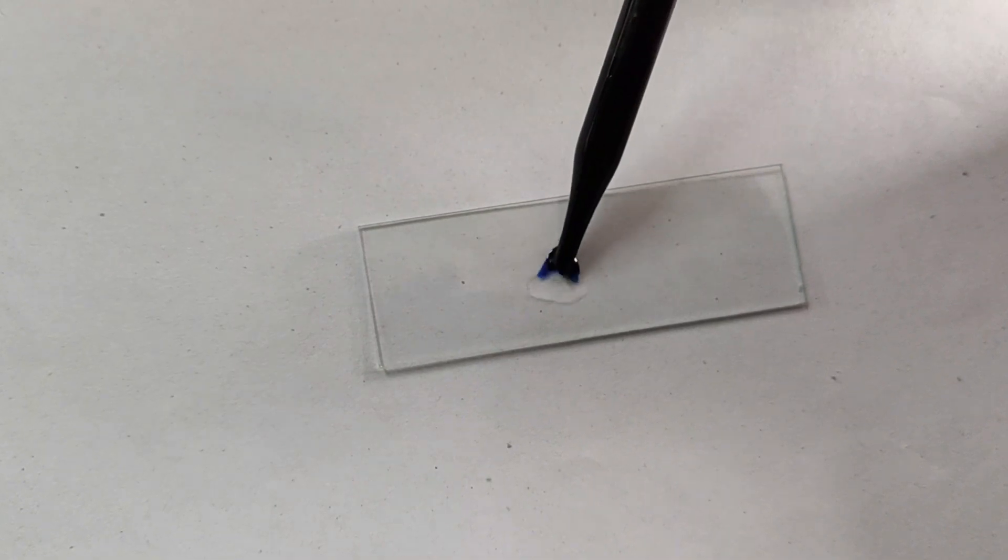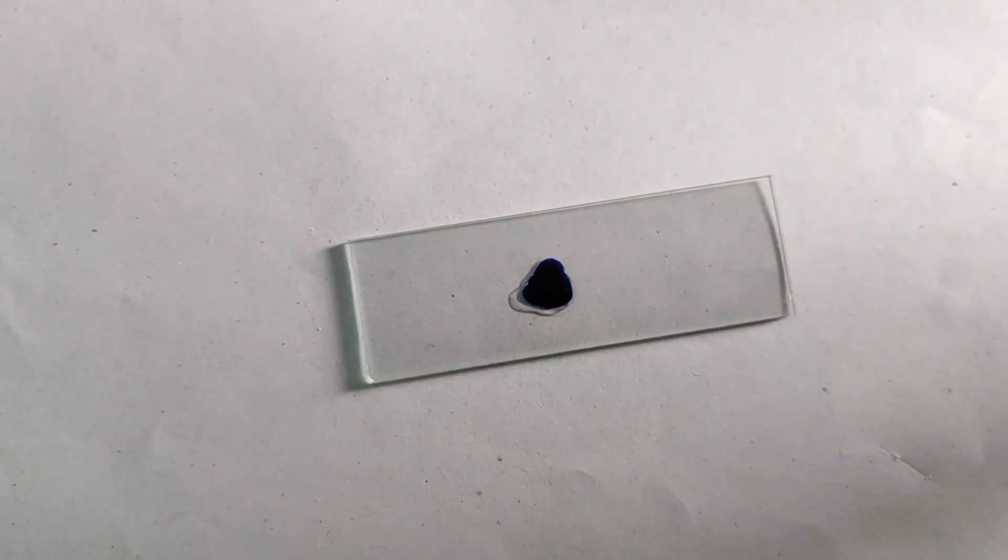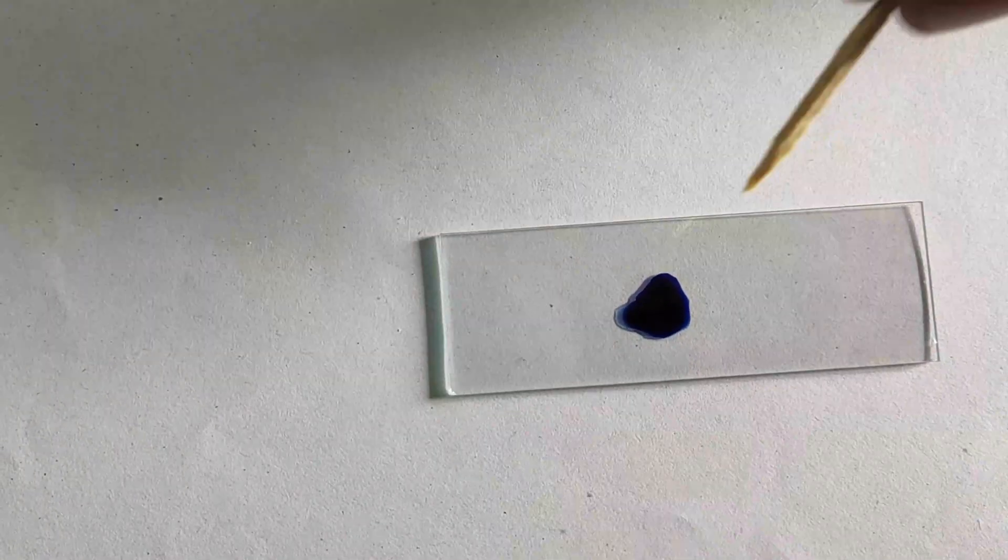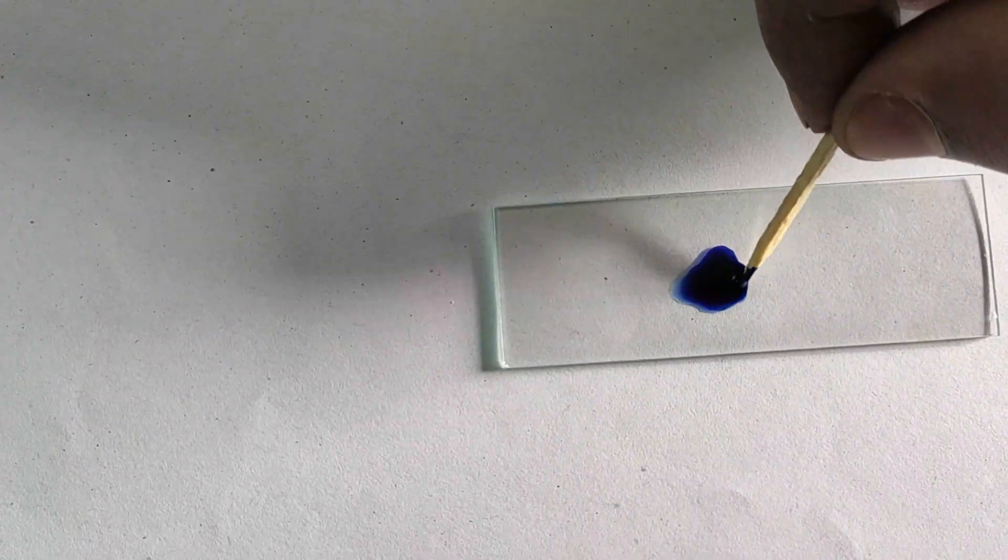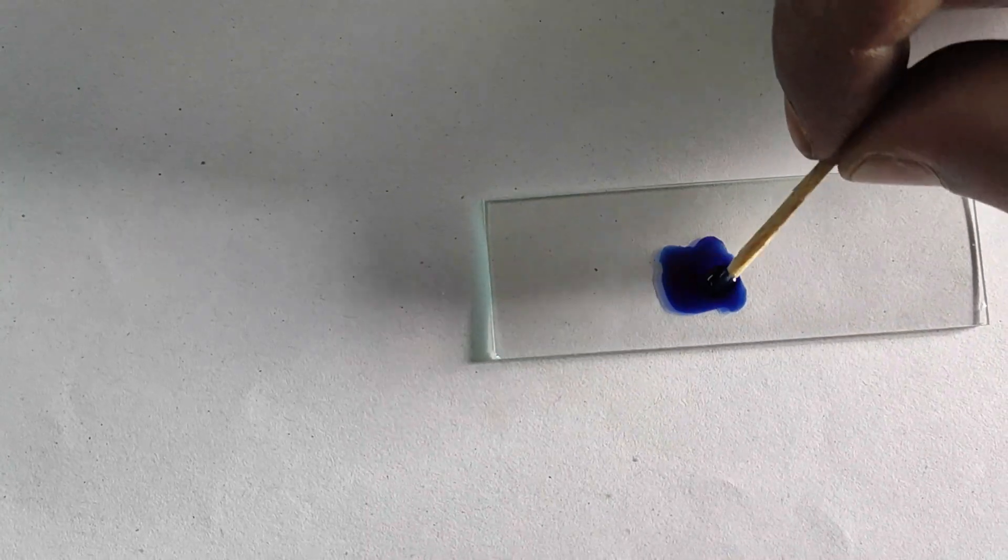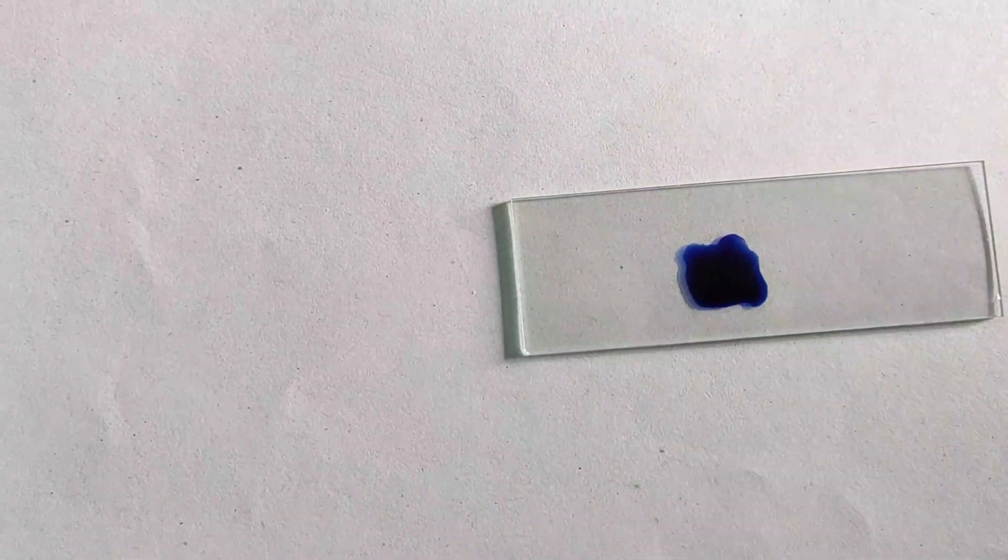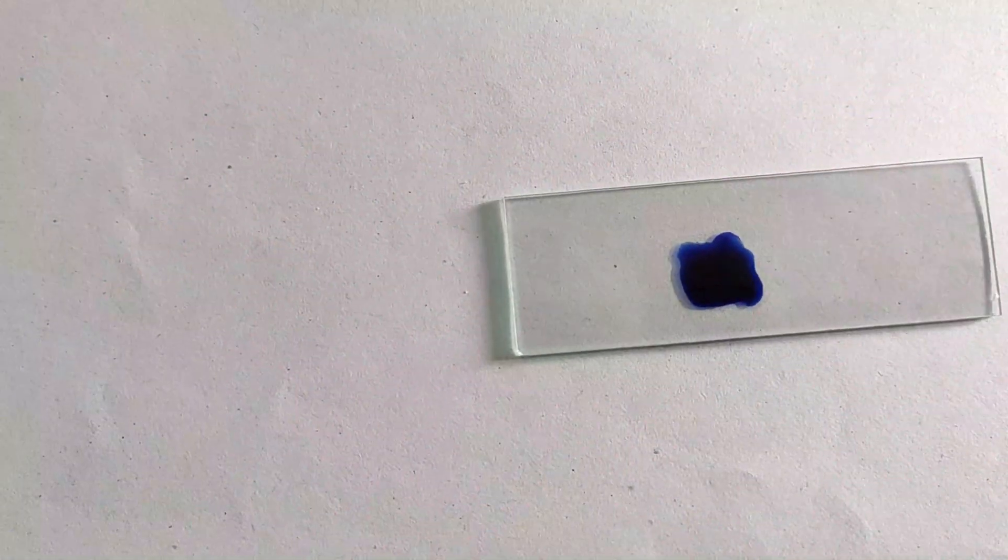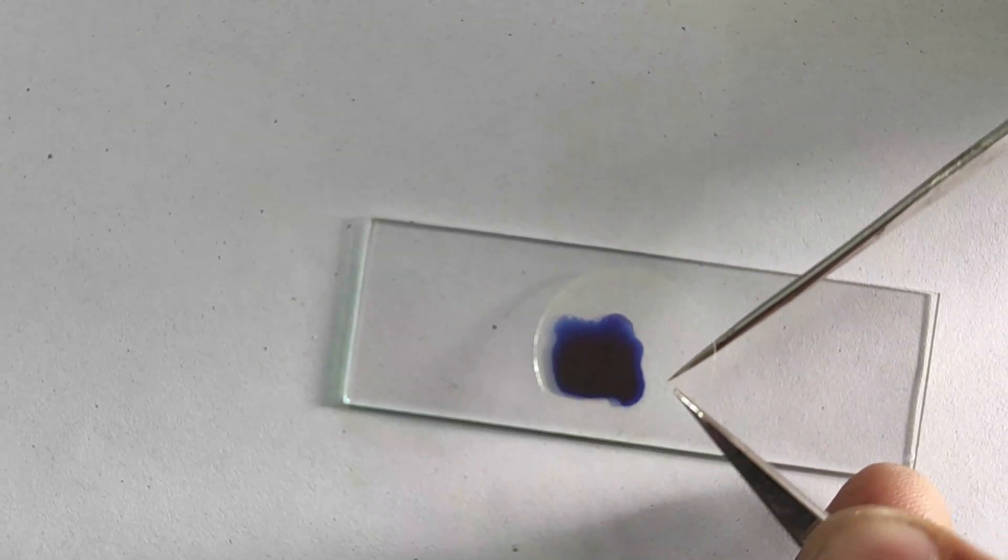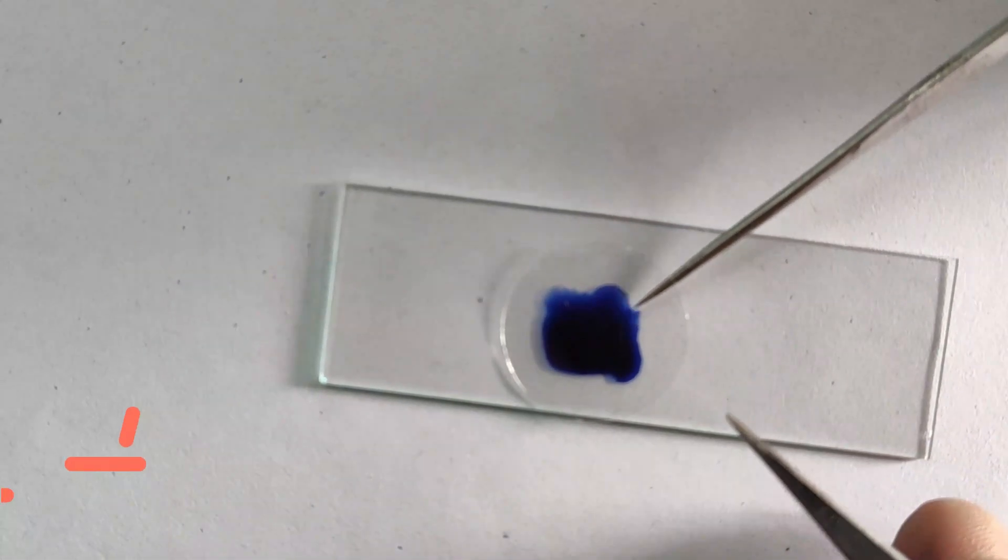Then finally we will mix up the material that we have collected from our cheek. Now with the help of a forcep and a needle, gently place a cover slip onto the material that has been mounted on the glass slide.